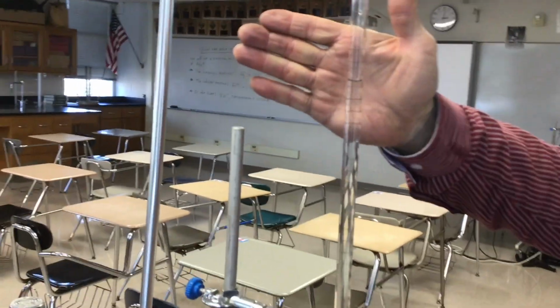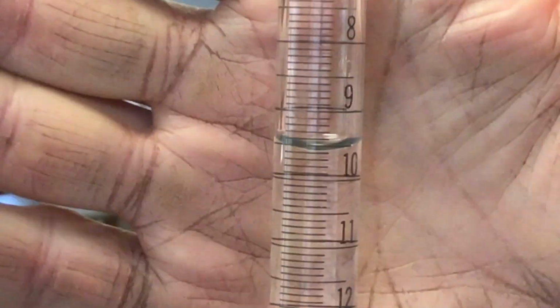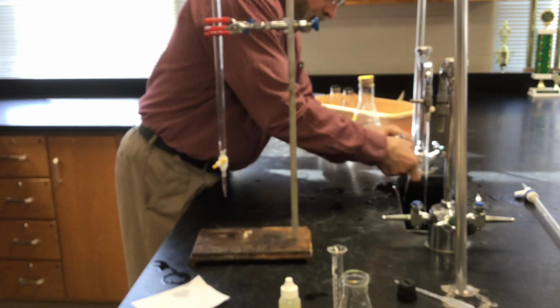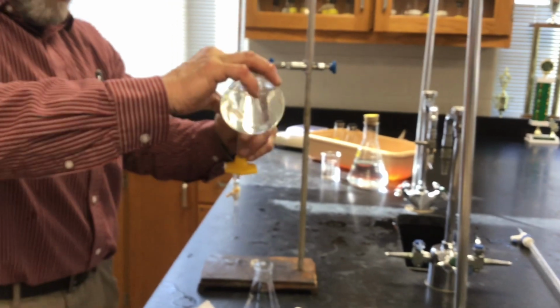When you have other students in the room doing this at the same time, it's nice to compare your color to others so we get a better idea of how close we are. Remember how we read that burette. Okay, let's run a second trial here.